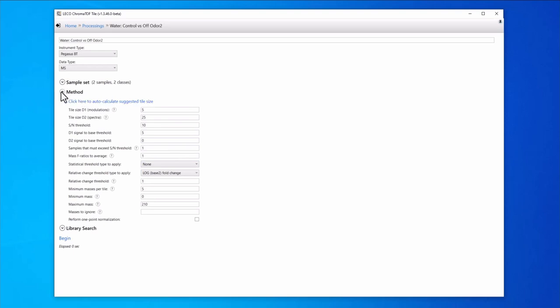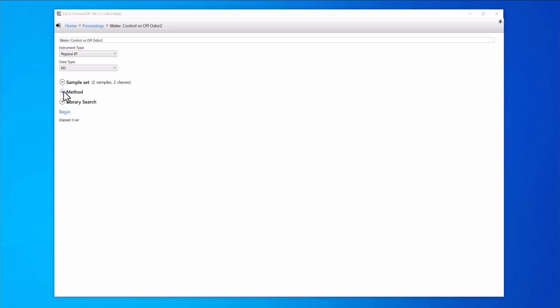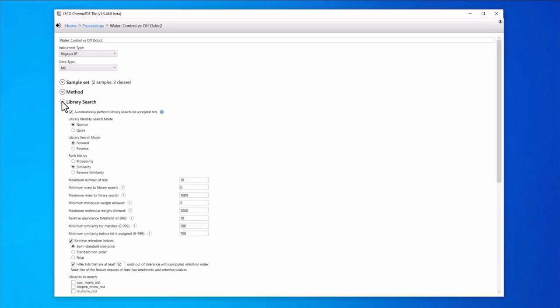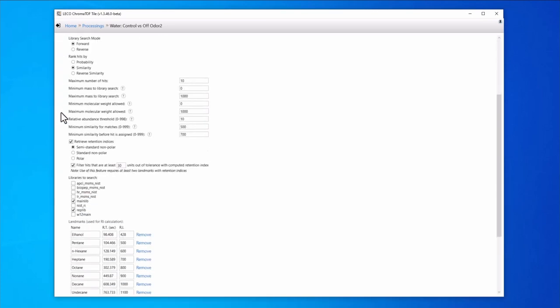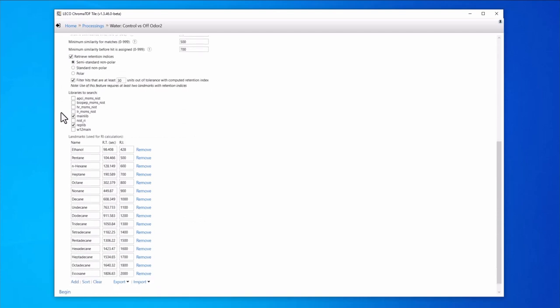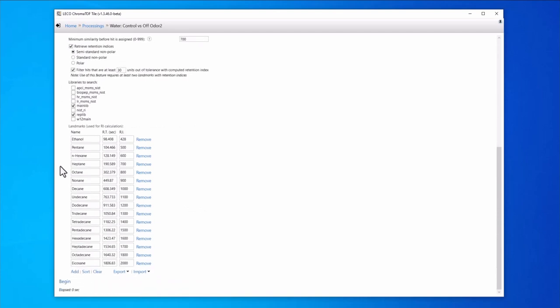The other data processing parameters are used to set the tile size and various other thresholds. The library search parameters and retention index landmarks can also be entered before clicking begin to start the data processing.